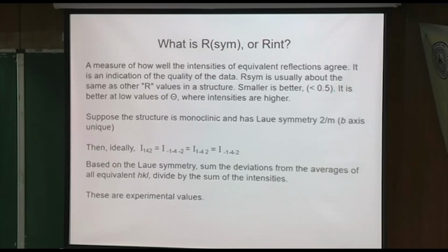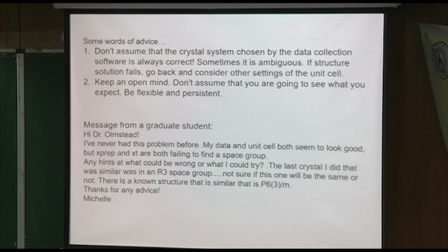And this is RSIM or RINT, so pretty much the same thing. Again, it's a measure of how well the intensities of equivalent reflections agree. OK. Well, since it's getting kind of late, I'll start this next time.